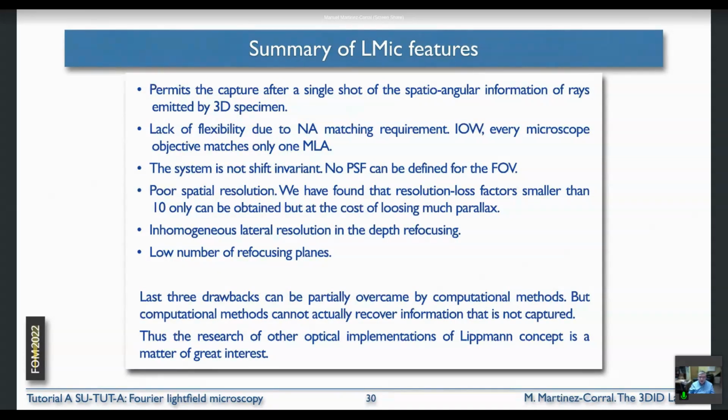Spatial resolution is a problem: there is a resolution loss factor of about 10. Not shown here, the depth reconstruction has no homogeneous lateral resolution. So lateral resolution, when you obtain the depth reconstruction here, is not the same. It changes plane by plane. There are good planes and bad planes, and the number of refocusing planes is limited.